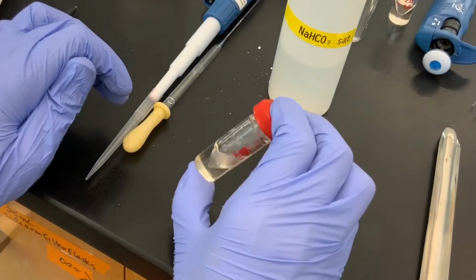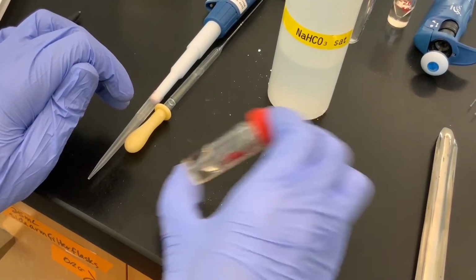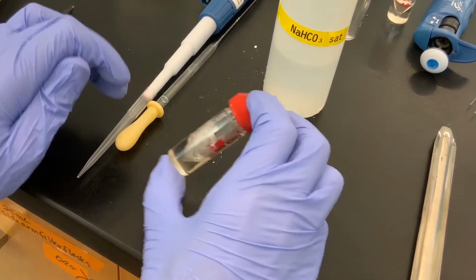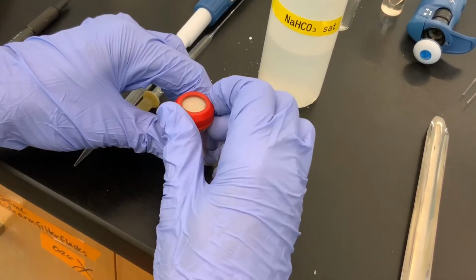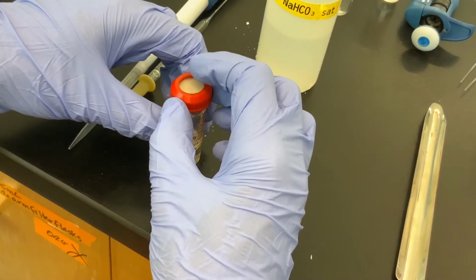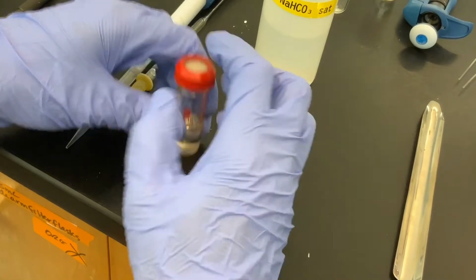Is it still giving off CO2? It seems like it's taking some time, but I no longer hear the carbon dioxide gas. So I think that we're good to go.